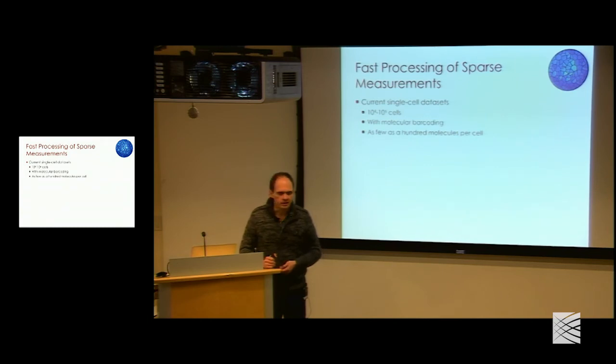The other issue is that there are sequencing errors associated with them, and so unless you have some strategy for distinguishing them, you might overcount highly amplified transcripts. In fact, if the error was generated early, it can actually look like a distinct molecule because you keep seeing that distinct UMI a number of times. So it's not perfect, but it's pretty good. If the UMI system was perfect, it would correct perfectly for amplification bias, but it's not. Anyway, it does clean up things considerably in terms of over-dispersion. So that's a now prominent feature. Although I should note, there's no full-length protocol that gives you a full-length transcript with UMIs, which is a pity because we would like to see that.